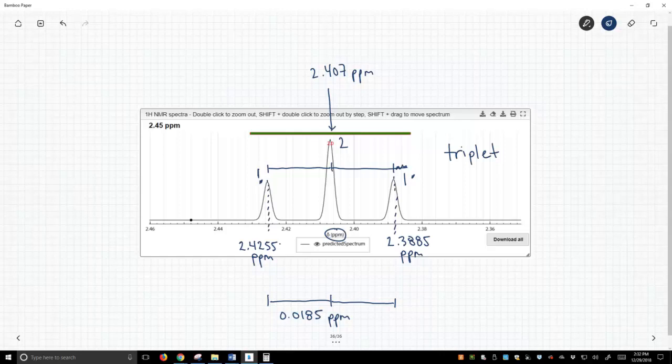However, if we measure this distance in hertz, that distance doesn't change from one spectrum to the other, and so this is what we get in our coupling values.